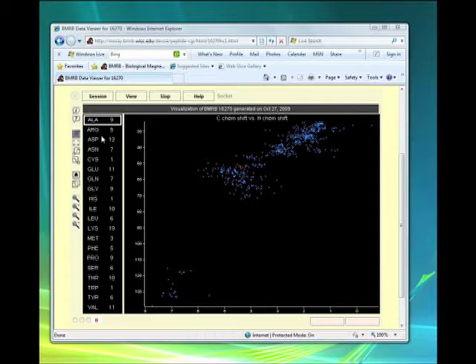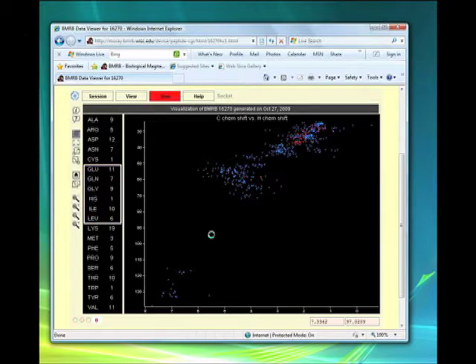In the view on the left, a DEVise cursor is used to select the amino acids for which we want to highlight the symbols in the main view. The cursor is this rectangular box. As you can see, I can move the cursor by clicking on the place I want it to go. When I move the cursor, different symbols are highlighted here in the main view. This particular cursor can also be resized by grabbing an edge with the mouse. You can see that more symbols are highlighted after I enlarge the cursor.